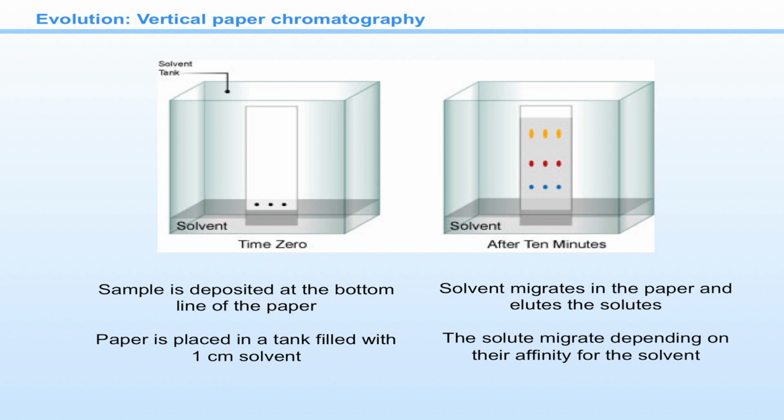Next, you have to take the paper gently and place it over the glass jar which is closed with the lid, and the organic solvent present in the jar and the sample which has been loaded on the filter paper, now you are subjecting it to the chromatographic technique. The solvent makes the sample drag and separate from one end to the other end, and you have to see carefully when it has reached the other end of the paper, and then stop the development of the chromatogram. Once the development is over, you have to take the filter paper and keep it for drying.